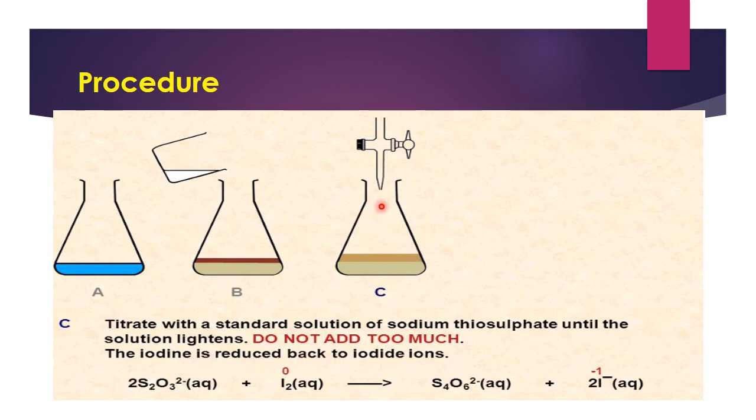يعني هنا بهاي الخطوة من نبدي titration with sodium thiosulfate راح يصير إنه الأيودين liberated iodine راح يرجع يصير له reduction، يختزل إلى iodide ion حسب المعادلة 2S2O3 minus 2 plus iodine. يعني هسه هنا يصير معادلة titration standard solution sodium thiosulfate مع liberated iodine راح يعطيني التتراثيونات ion plus iodide ion، يرجع يتكون الايودايد بفعل الريدكشن.